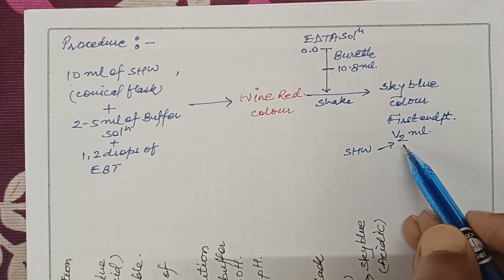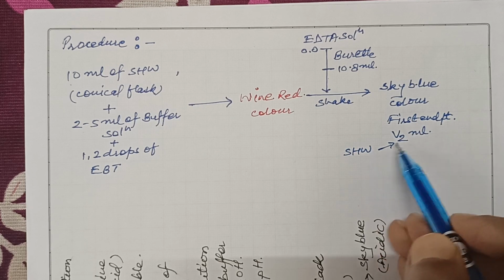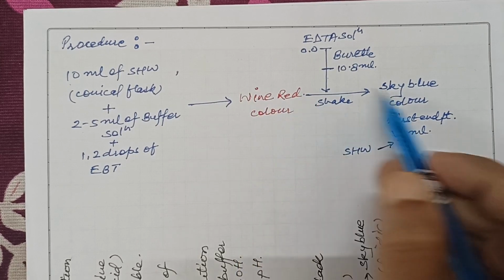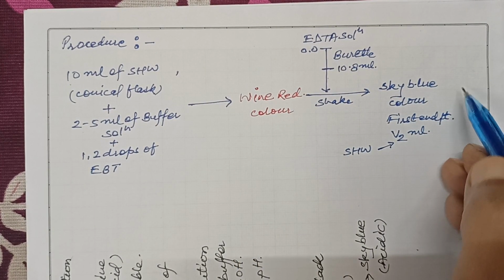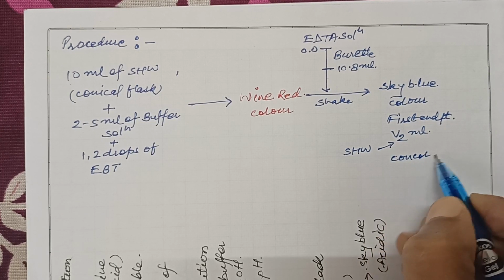After getting this first endpoint with standard hard water, we repeat this whole process to get the concordant reading.